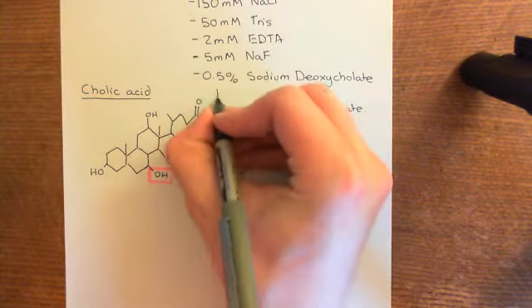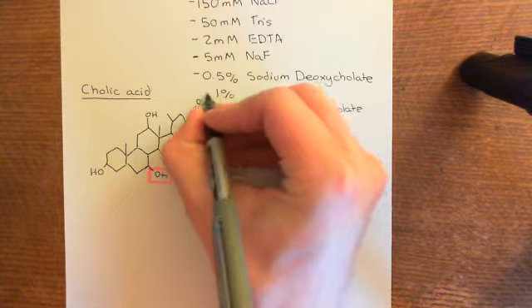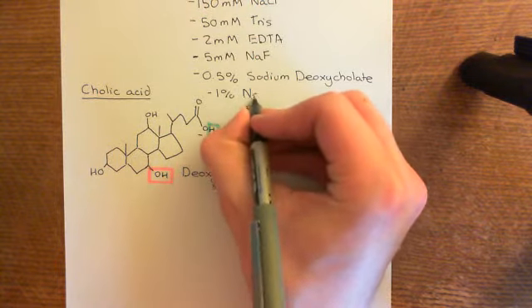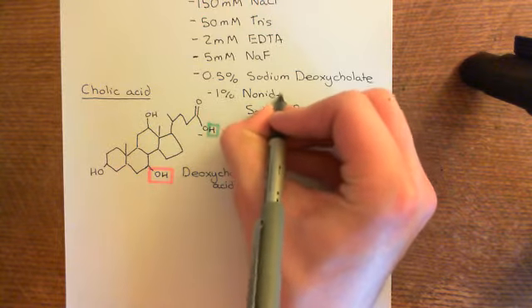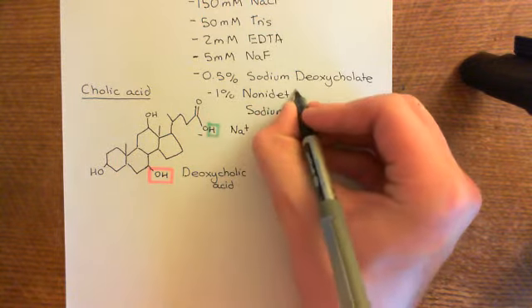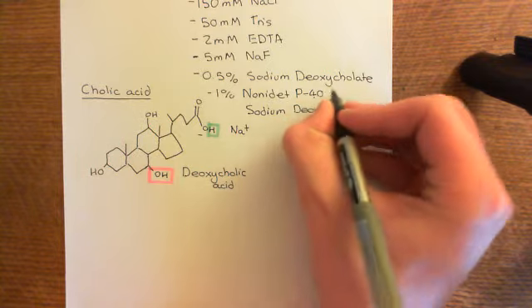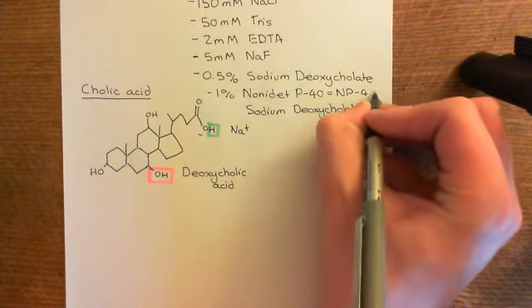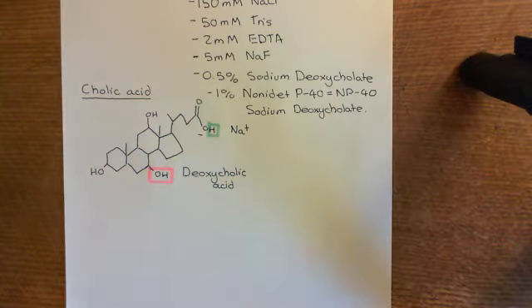Okay, so we're also going to have 1% of a molecule called NP40, and NP40 is short for Nonidet P40. Okay, so Nonidet P40, and this is usually just abbreviated to NP40. This is a detergent molecule, as you'll see in a moment.